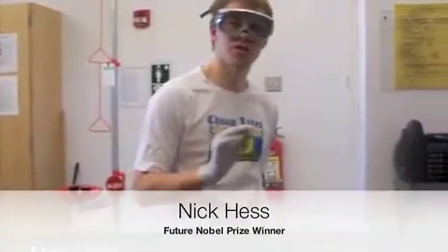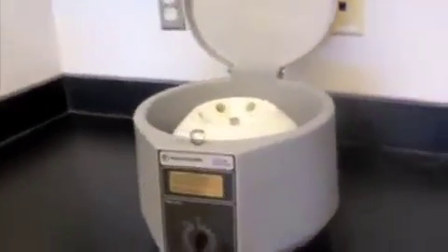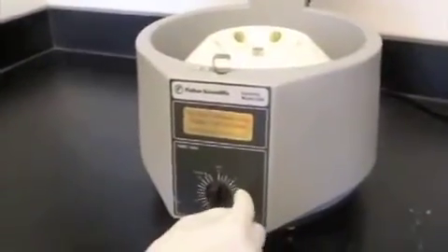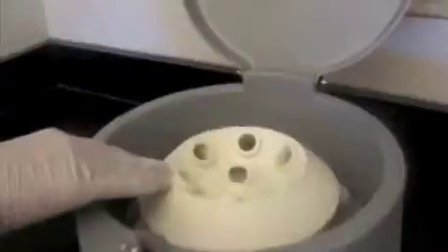Now we have a short instructional on how to use a centrifuge. Here is the centrifuge that you could be using in lab — you can see it here. You have the knob that sets how much time you want it to run, and in here you have the six rotors.